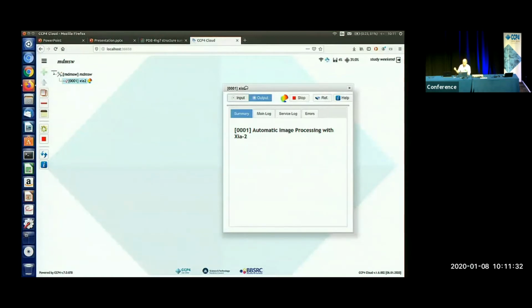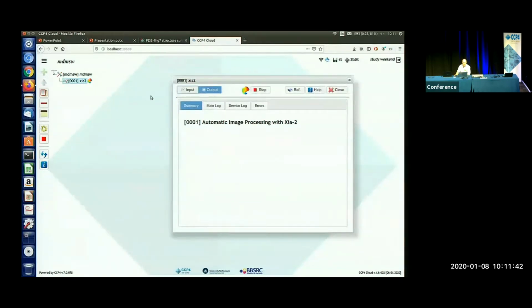But if you use Diamond, for example, it is integrated with the ISPyB database at Diamond for accessing images. So in big institutions, if you have a centralized image store, you can integrate it with that, and you can do all of the image processing on the cloud.